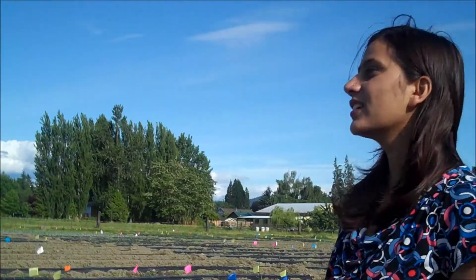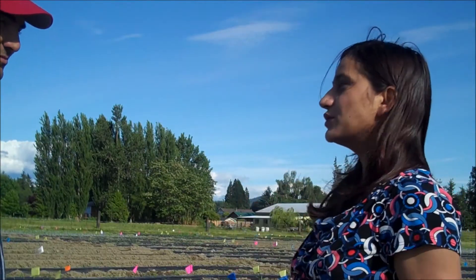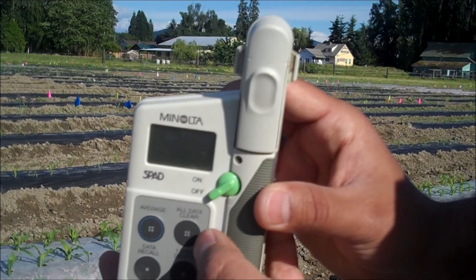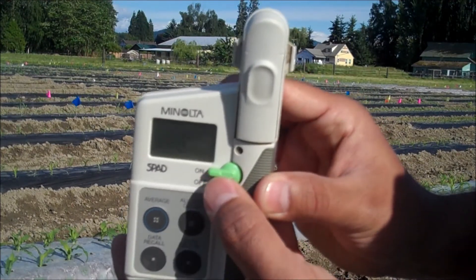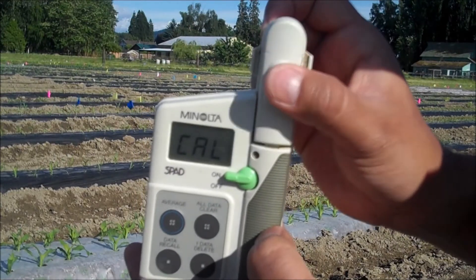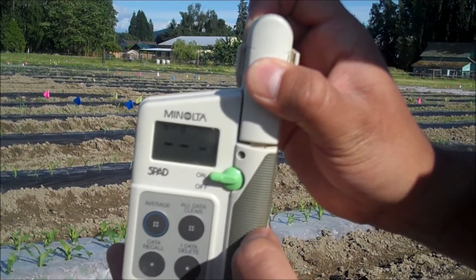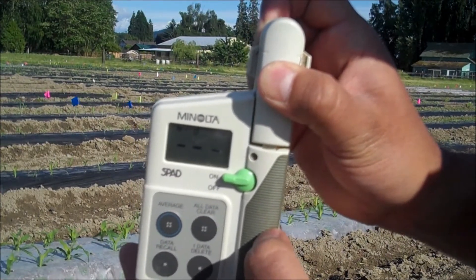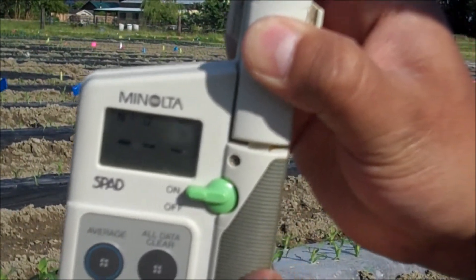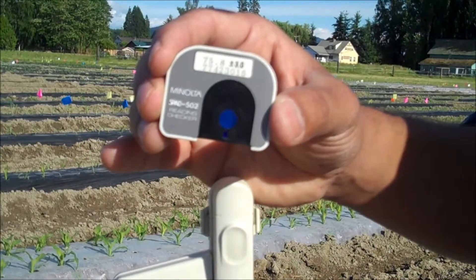Wow, this is really cool, tell me more about this! To operate this, first turn on the device with no sample in the sample slot. Press on the finger rest to close the measuring head. Then you'll see the number of data in memory as N equals — since there is no data now, N equals 0.